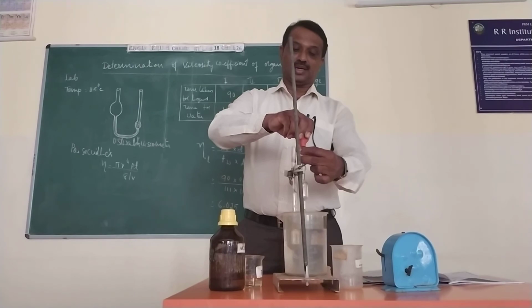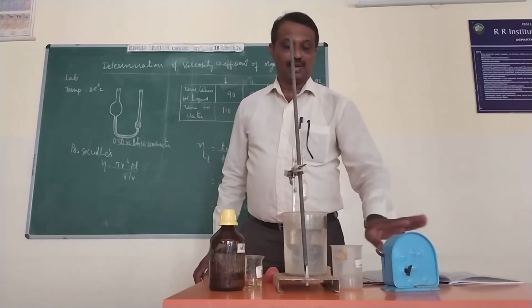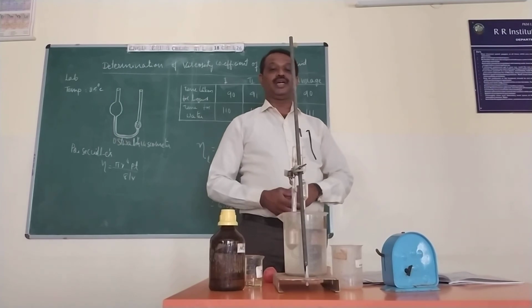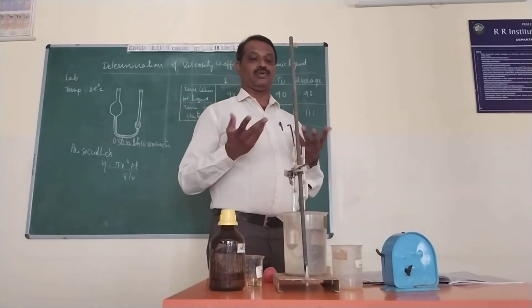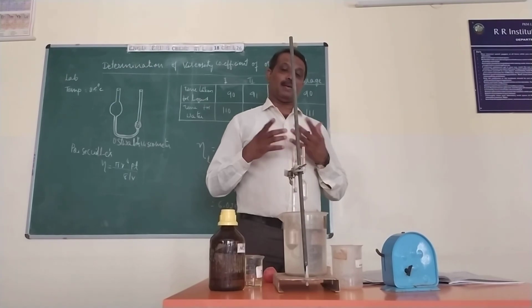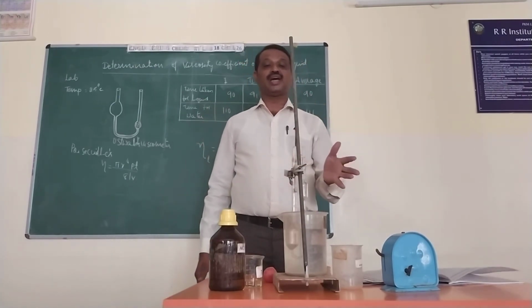So it is transferred. Afterwards I can start moving this liquid from the upper end to the lower end, watching it. It is 110 seconds, 112 or 111. So that is one trial. If the third trial gives 90 or a very abruptly varied time in seconds, you discard what you already recorded.